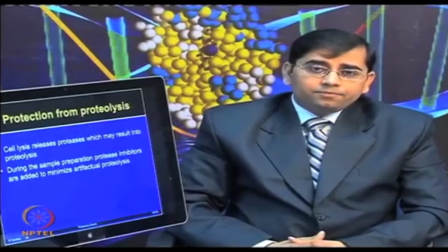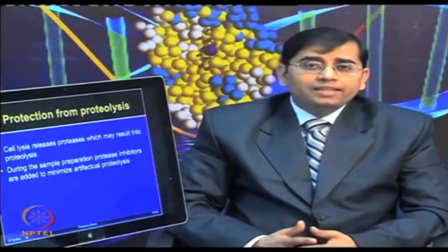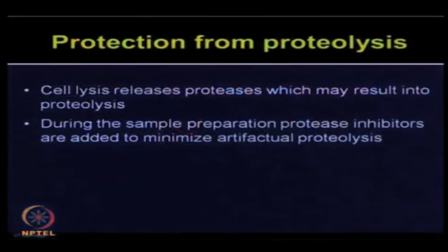Cell lysis will release various proteases, which may result in proteolysis. During sample preparation, one can use different types of protease inhibitors which can minimize artifactual proteolysis.